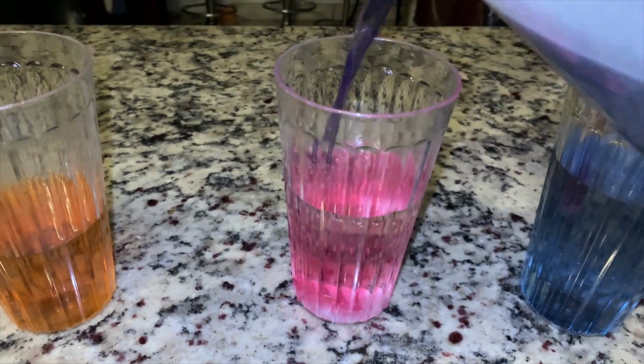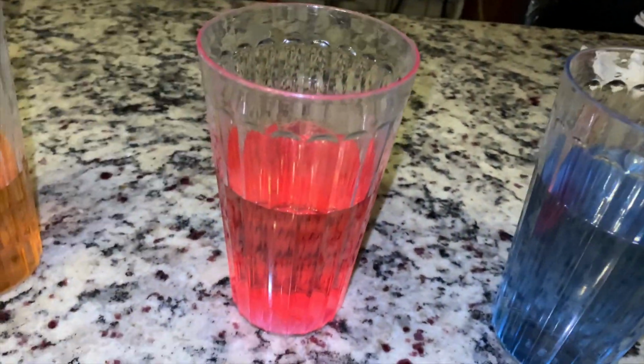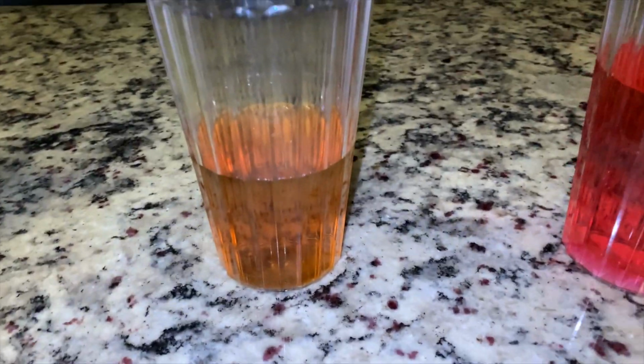Right there we have the acetic acid, or just white vinegar. As you can see, that's more of a reddish slash pinkish color. This means that this is an acid, and something below 6.9 is considered an acid.